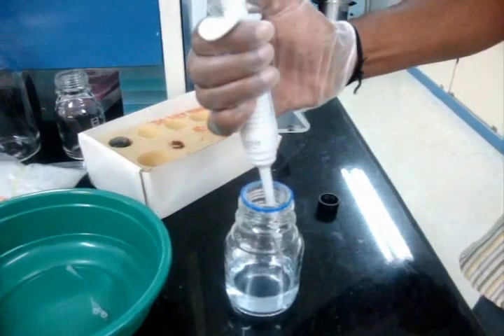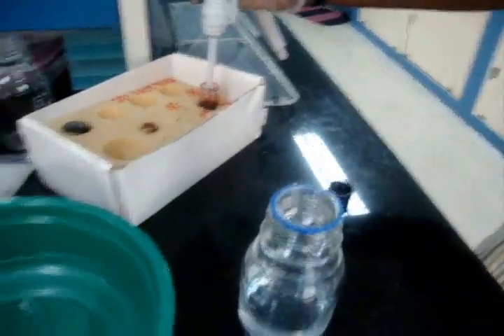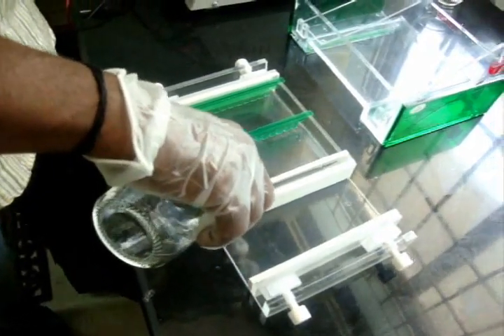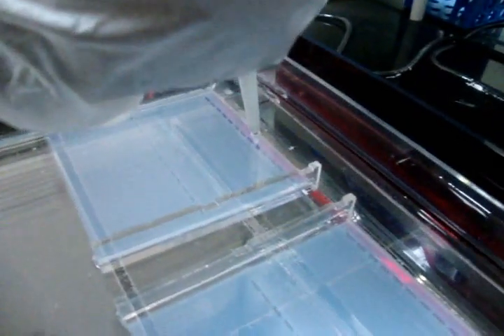The next step is agarose gel electrophoresis. Ethidium bromide was added into the agarose gel. The agarose gel was poured into the gel casting tray and allowed to solidify. Loading dye was added into the PCR plate.